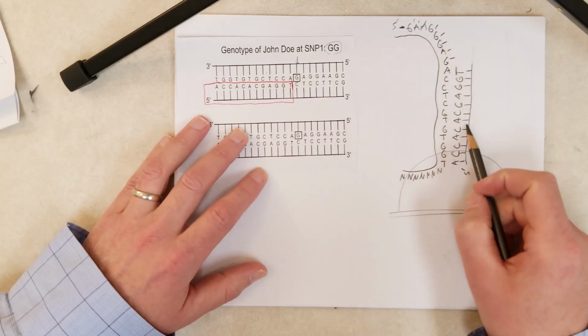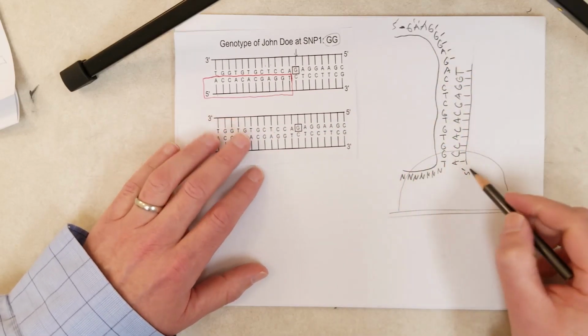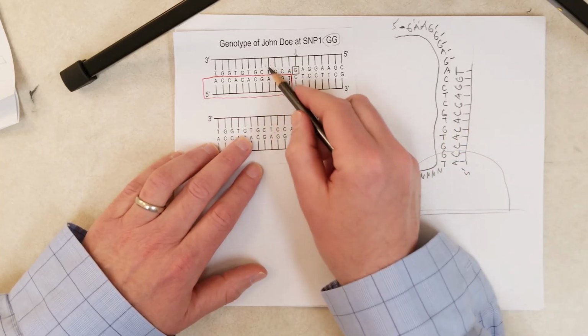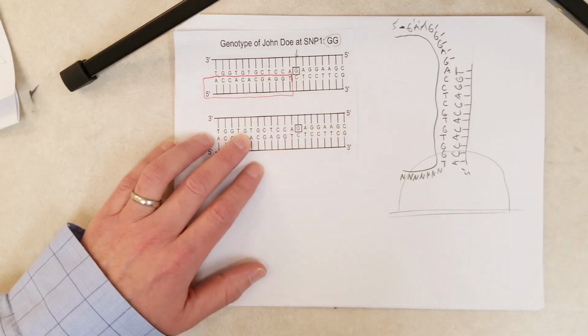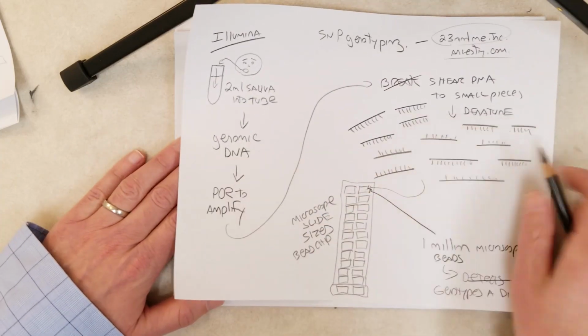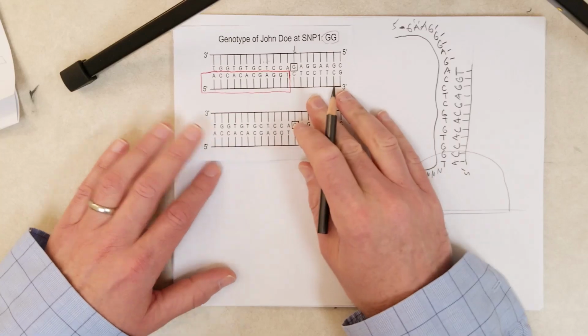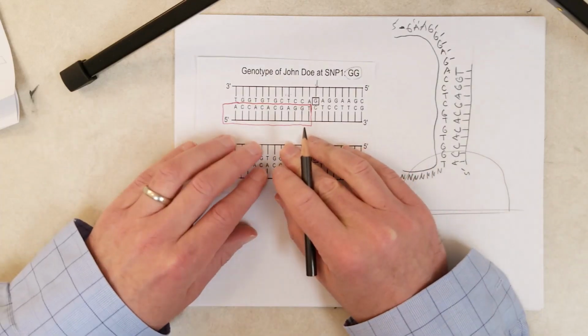And eventually it found that SDO and annealed. And remember, there are 1,000 of these SDOs here, identical. So the other copies of that part that were floating around here are going to stick to those other SDOs. Okay, so what's the next step?